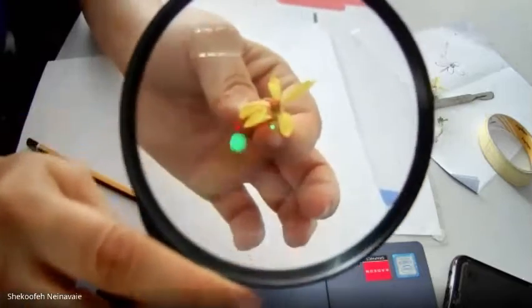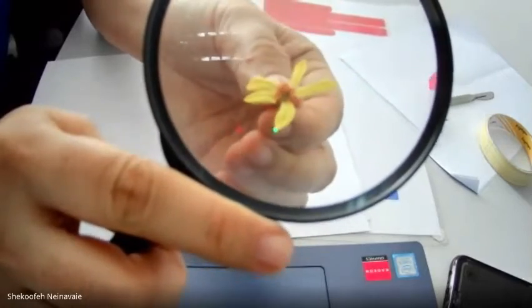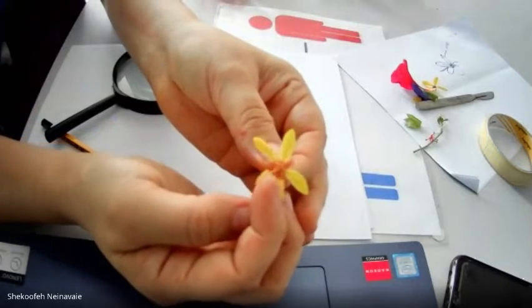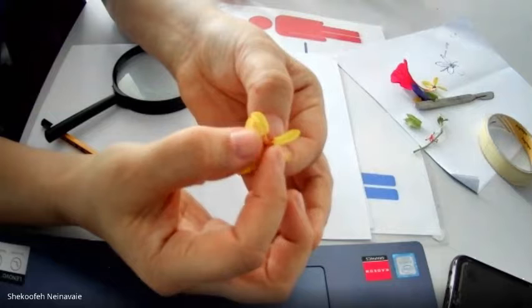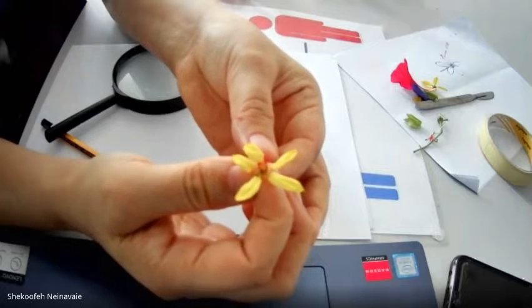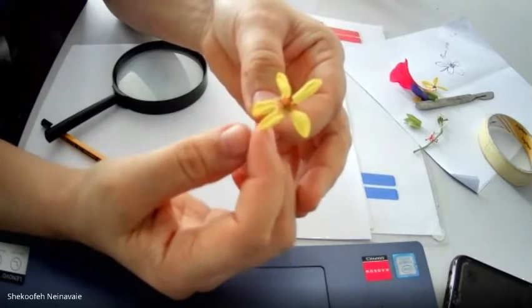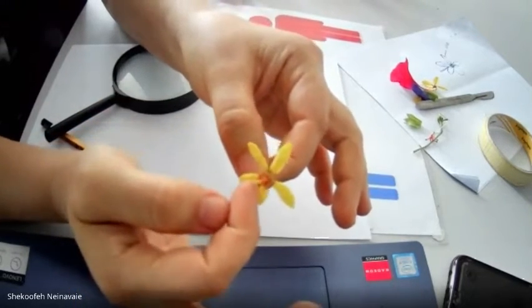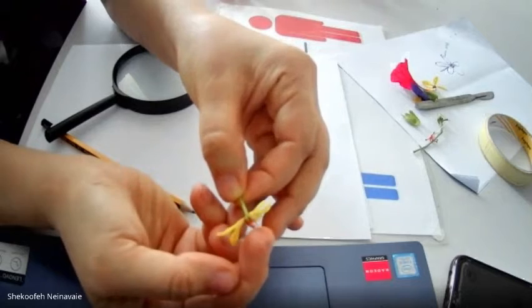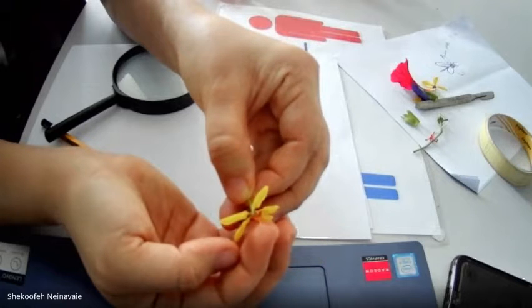I'm not sure if this is obvious for you here. I'll bring it closer. This one is only one, the female part, which is longer compared to the males. The male, which is called a stamen, is made of an anther and a filament, a filament that connects the anther to the body of the flower. And then they are surrounding, going around this female. The female sticks out and is very different from the male part. Still, the color stays the same here after fertilization.